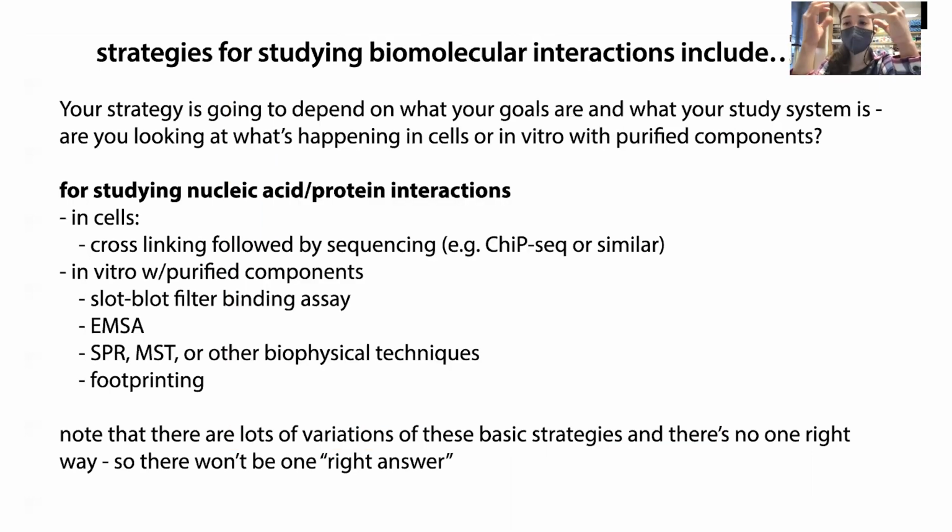The important thing to note is that it's going to give you information about the binding. You can get information about the binding and the unbinding, so you can get actual kinetic information about K on and K off.